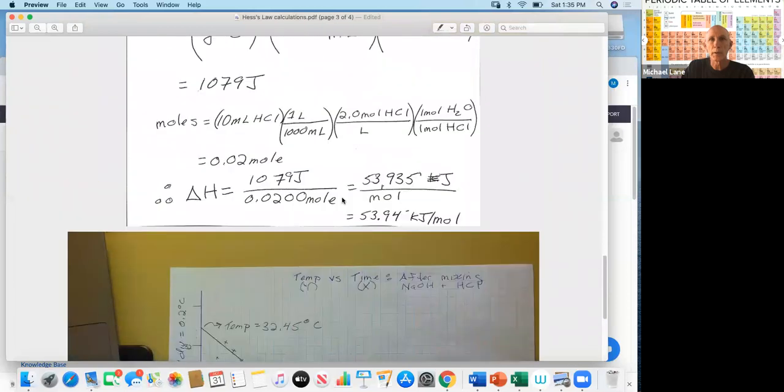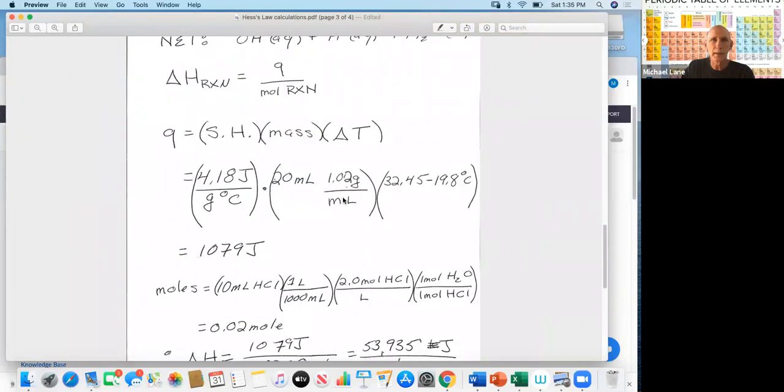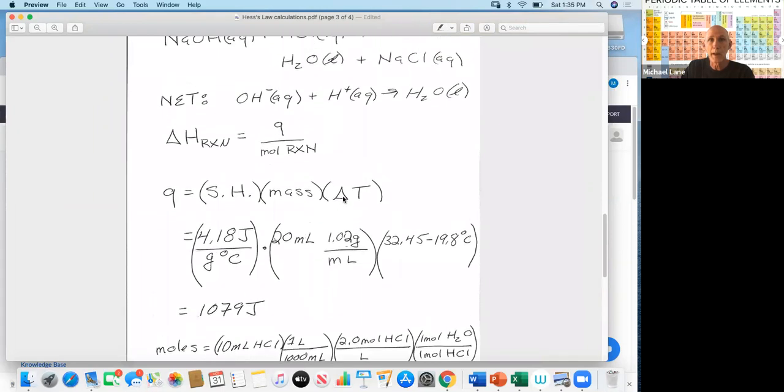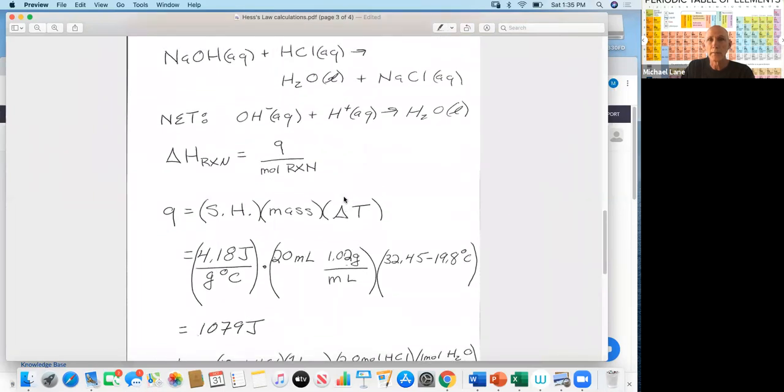Okay, so I come up here to the calculations, and I certainly hope that they're not identical. They match in every meaningful way the calculations given you in the HOL website. So one, here's the reaction. Of note, here's the net ionic reaction, and you're going to need to write the net ionic reactions for each of the 3 different chemical reactions.